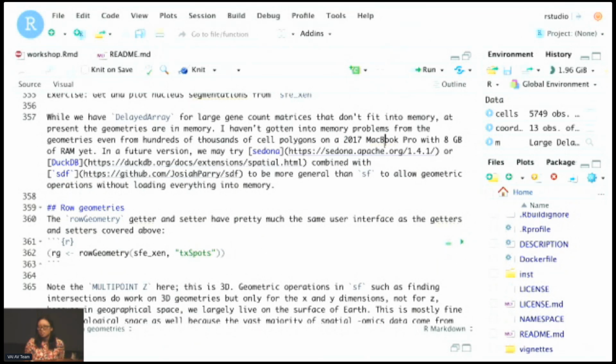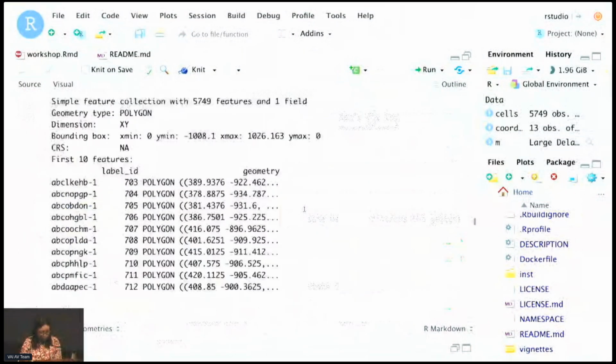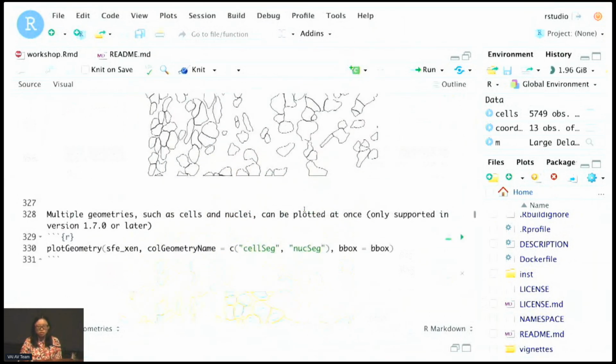And then Beneath also wants to know, when you're reading in the Seurat data, it was pulling in just the RNA assay, and why not SCTransform, or can it do both? It's actually SCTransform. Actually, you don't really have to use Seurat in order to use SCTransform. I think there's a way to just use the matrix for SCTransform.